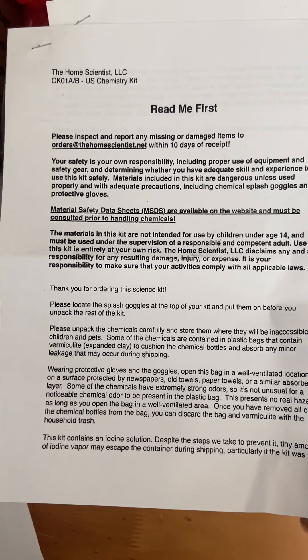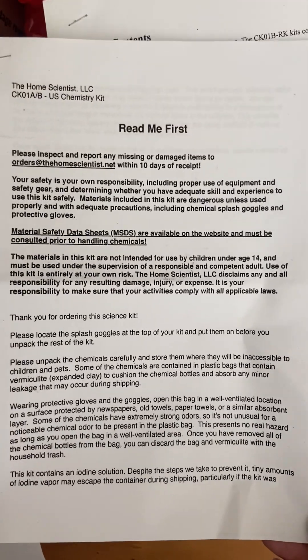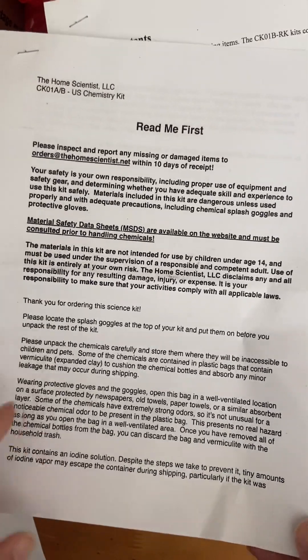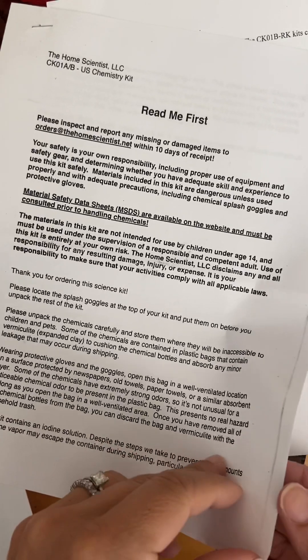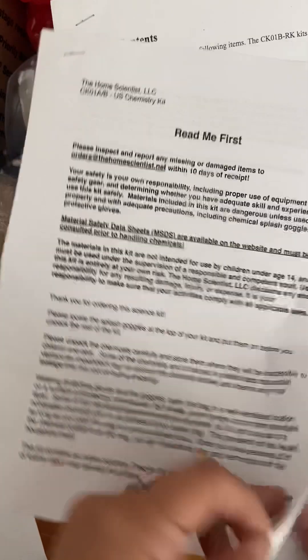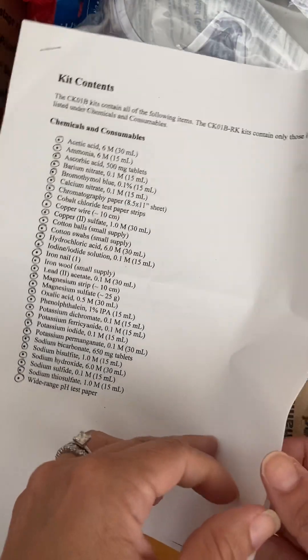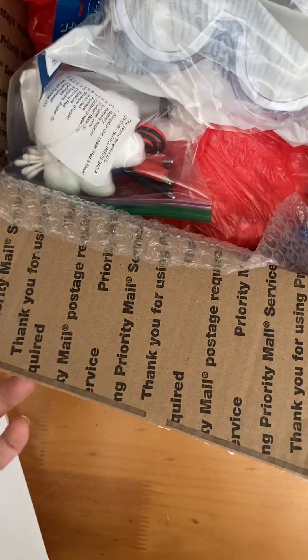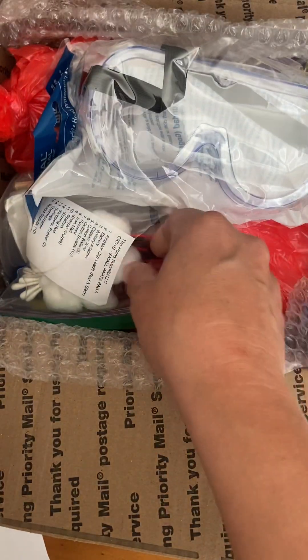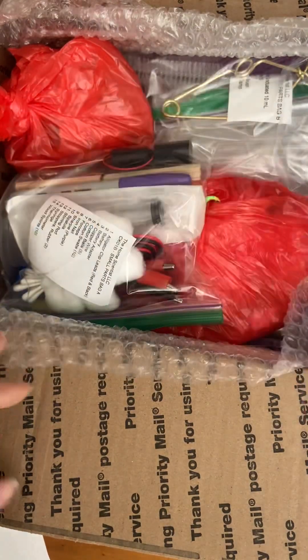I think this is about $117 before shipping. So this is the first paper that comes in the box — it's a safety sheet. Then it comes with the kit contents list. My daughter has already opened this and looked through it a little bit, so that's why it's not quite flat.